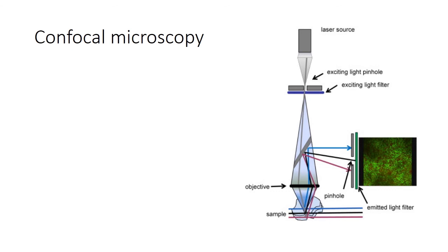Many images of the specimen are taken corresponding to all these different frames, and collectively all of those images are then compiled by computer software, and the planes are overlaid onto one another. This can produce a three-dimensional image of the specimen. So as opposed to the previously described types of microscopic techniques, confocal microscopy can also produce three-dimensional images.